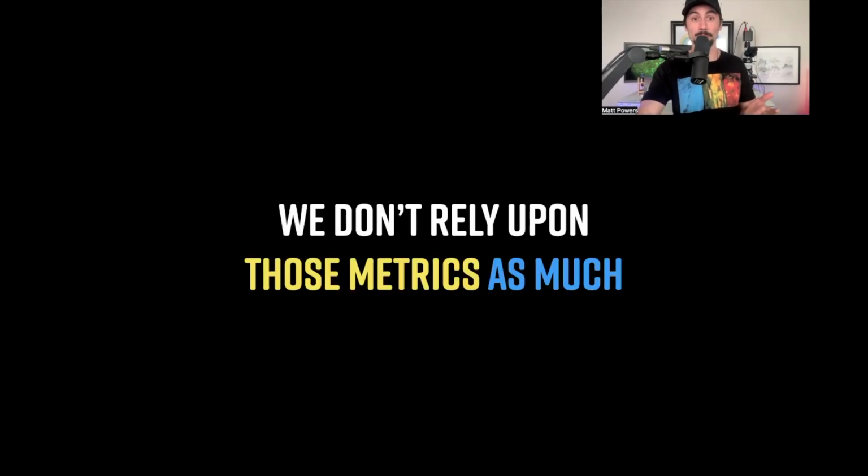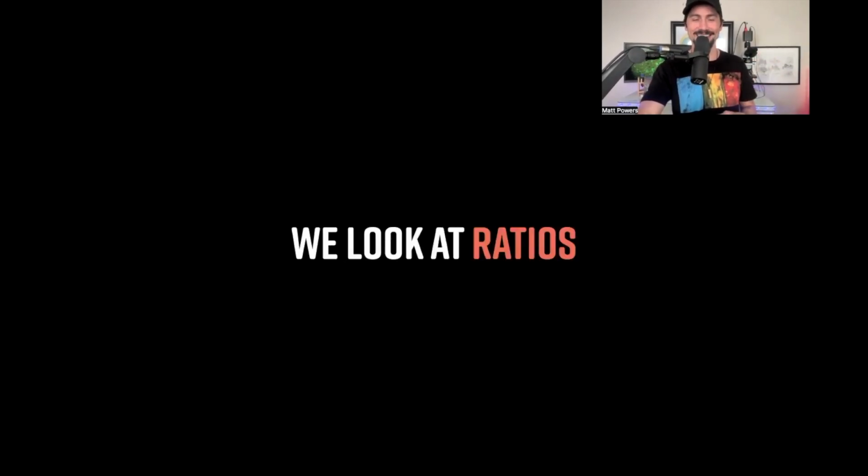That's why people find this so difficult, because there are too many variables that we cannot accurately measure. So what I decided was to go completely around this whole problem. I don't rely on those metrics. I show people how they can get them so they can prove this to themselves. But we look at ratios, just like they do in all the other laboratories and all the other sciences. They're not counting all the sharks in the bay in San Francisco and then all the fish. They're not capturing them all. No, they're taking a sampling and doing ratios, just like the wolves to the elk ratio and all that. That's all we're doing here. Classic.